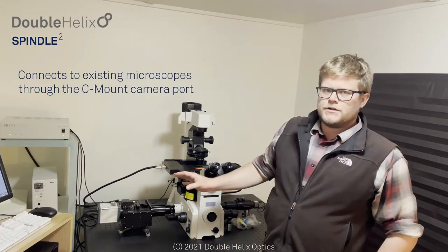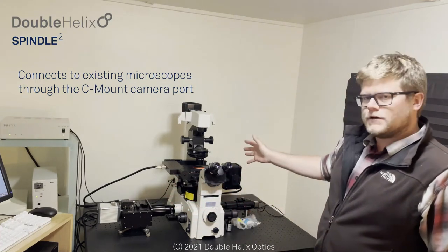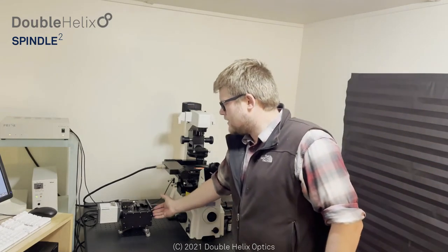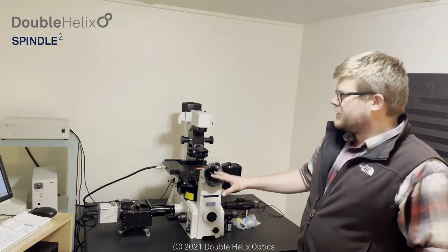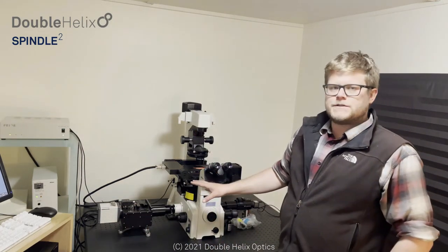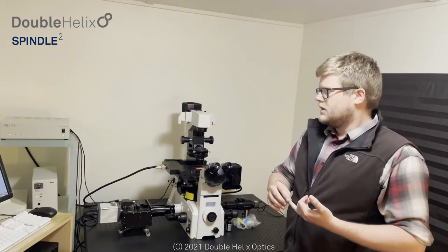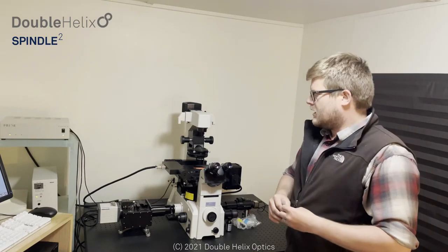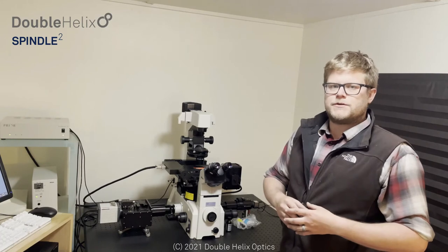Before we get started, I just wanted to show you the setup that we have for today. We have a standard inverted microscope platform, our Spindle Squared system, and a scientific CMOS camera. We'll be using this to walk through a few demos: multi-color imaging, multi-color engineered point spread function technology, and a couple of splitter and combiner type imaging modalities.